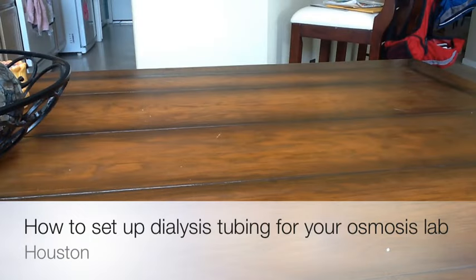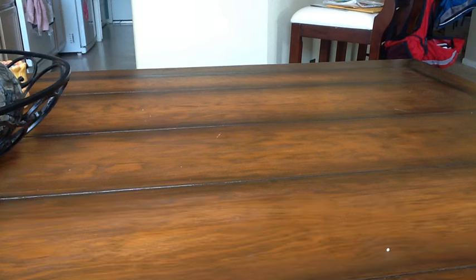Okay, today we're going to learn how to set up dialysis tubing so that you can do an osmosis lab.